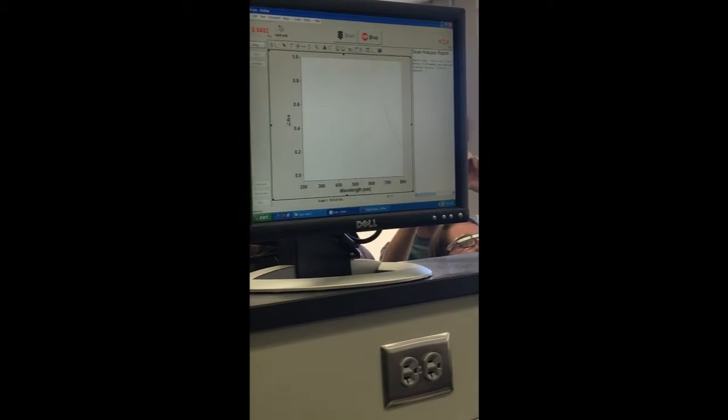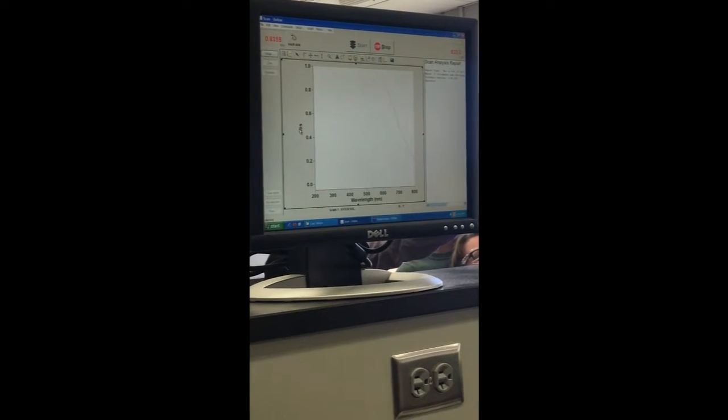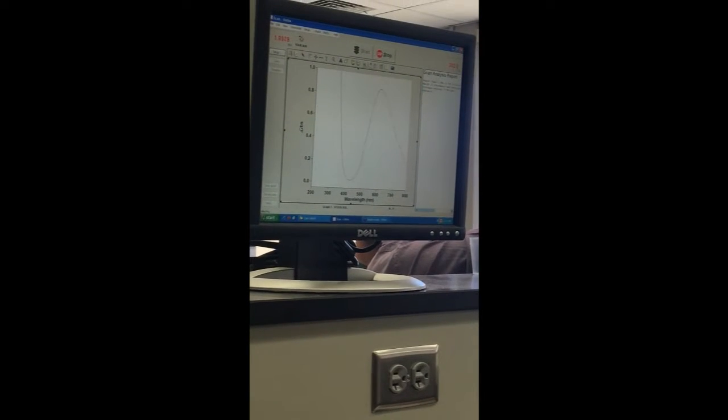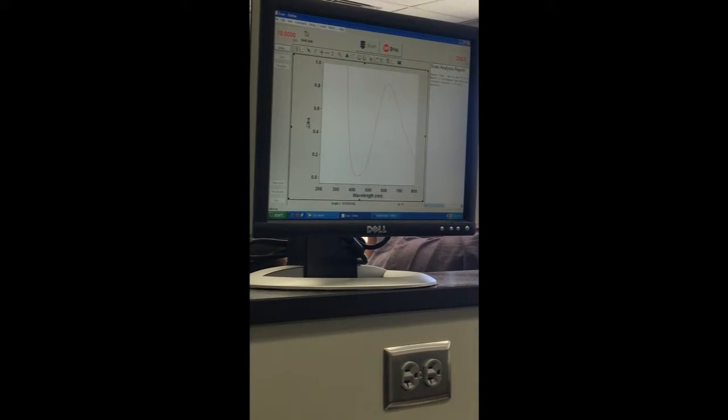This process gives us the ability to observe purity and determine the best wavelength to scan the dilutions, generally known as the lambda max. The lambda max is the wavelength where the most light is absorbed into a solution.